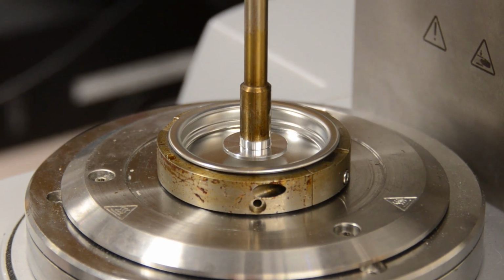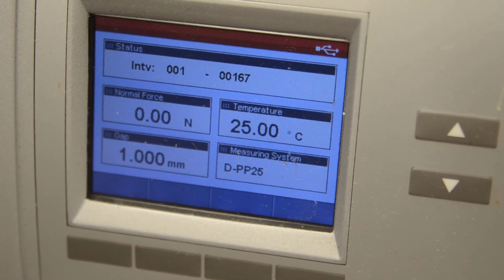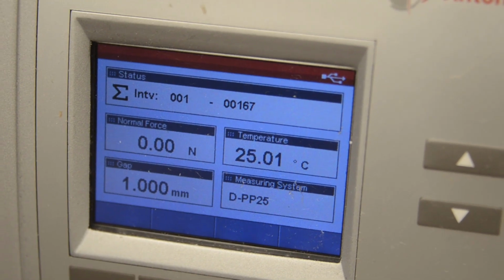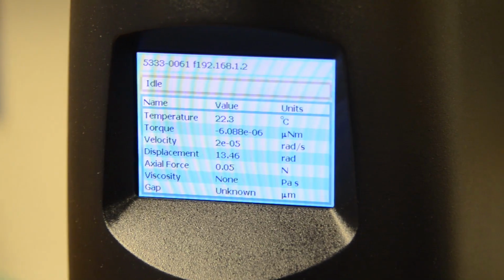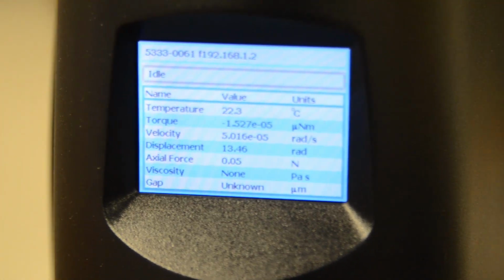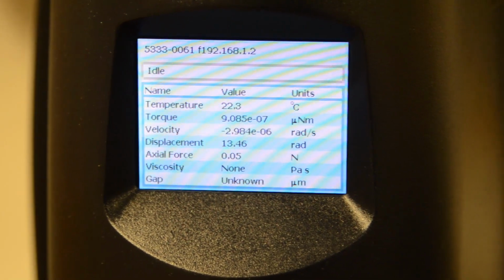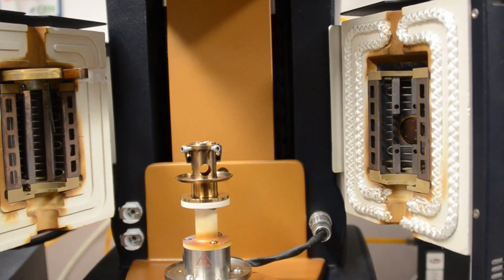The exact mechanism is proprietary to manufacturers but can involve electromechanical systems which measure and maintain position without interfering with torque or force measurements. Torques are applied to the sample with a precision electric motor. These motors are optimized for low rotor inertia and precision positional control. The torques required to deform the sample can be measured via motor electrical currents.